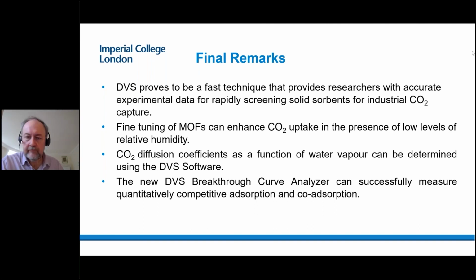Thank you. A question here from Nick Filstra. Can you talk about what the dead volumes before and after the sample column are like, and how significant are they for this instrument apparatus? Yeah, that's a really good question, Nick. Thanks for that. There's a few ways you can approach it. The dead volume is essentially what, if you're familiar with gas chromatography, you might describe as the hold-up volume. It's the volume in the system that doesn't contain sample, and it's something we have to measure in the column.